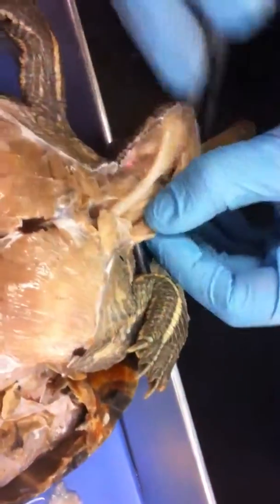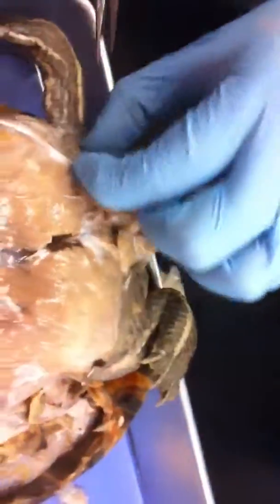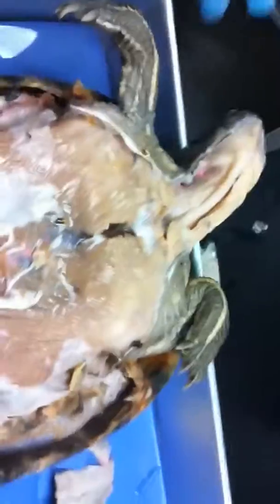They all attach in the back of the skull. These are very flexible muscles and they're very, very tough. What you need to do is skin these limbs and we can talk about more muscles.